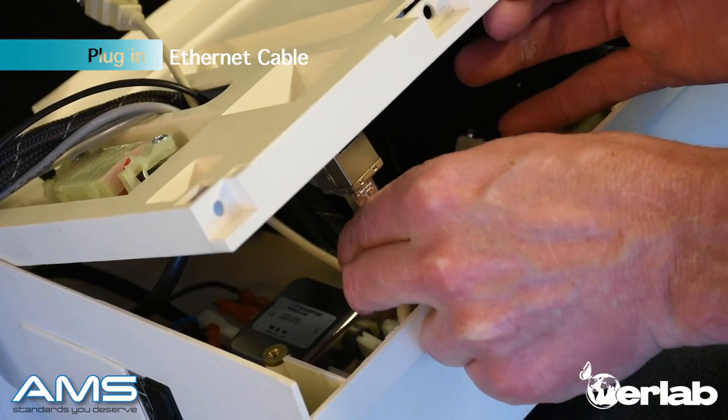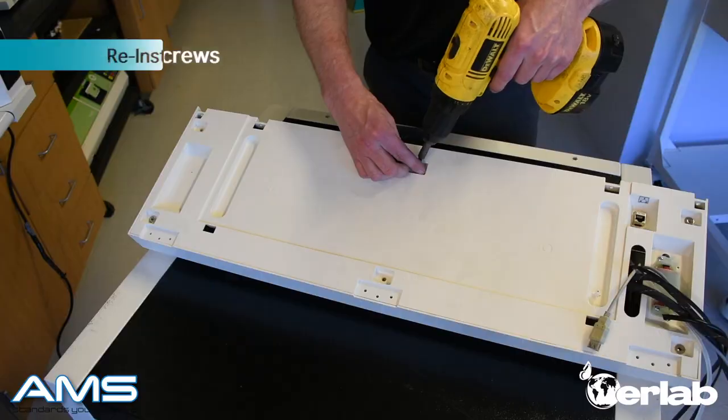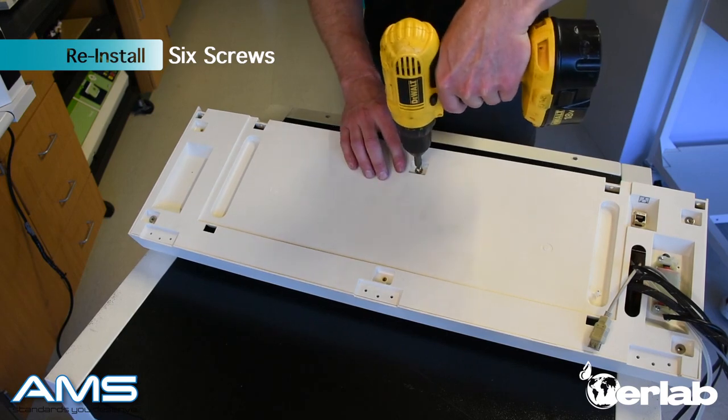Slide the panel up and make sure to connect the ethernet cable. Close the cover tightly again and now replace all six screws that you took out of the module.